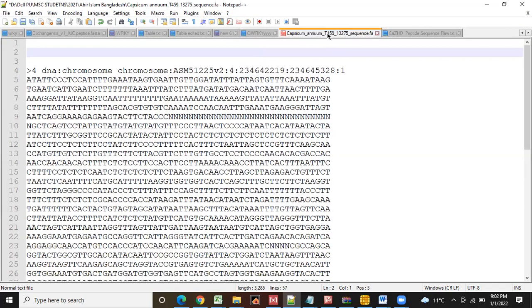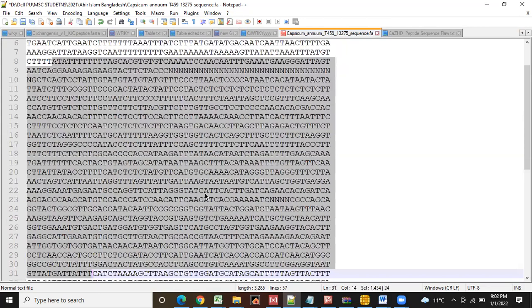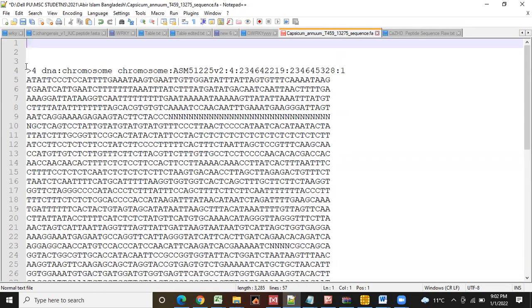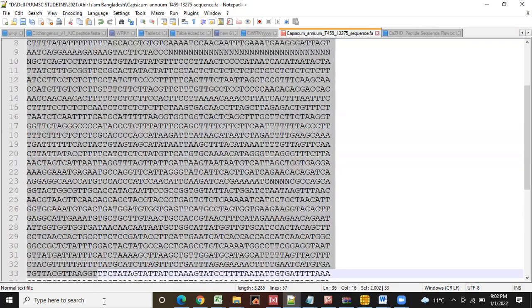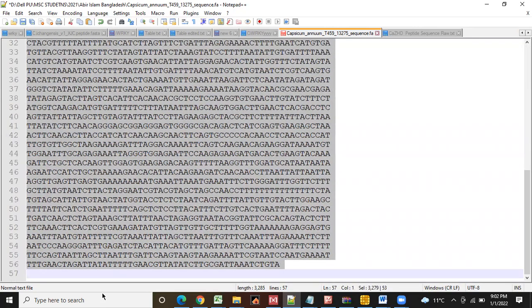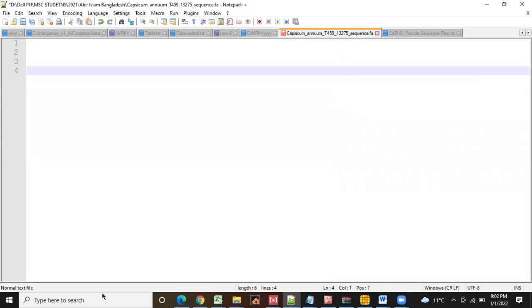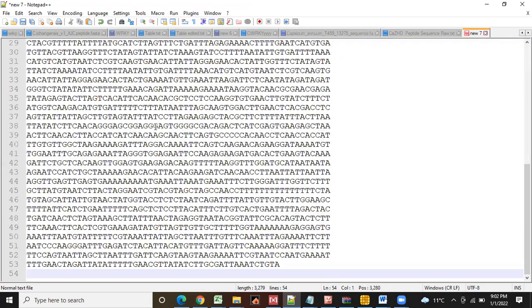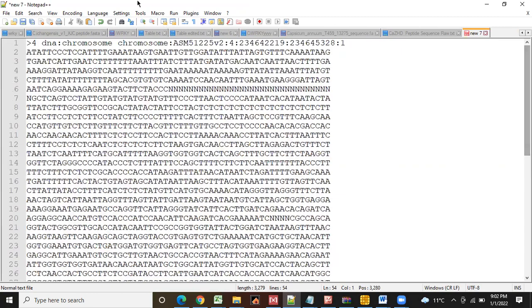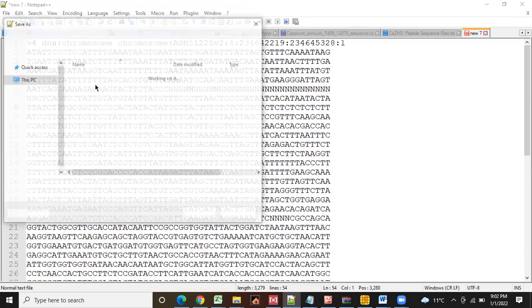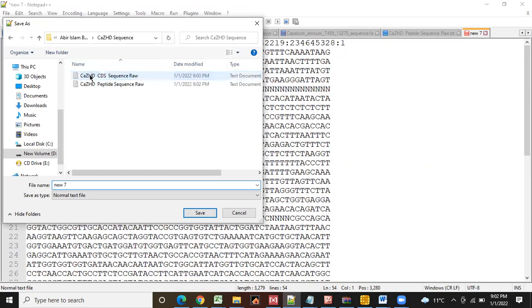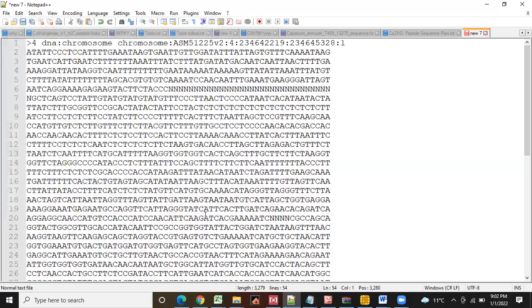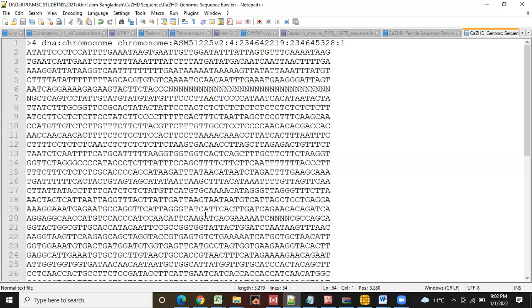Similarly, you will go with this overall. This is genomic sequence that contains promoter, open reading frame, and terminator. Control X, Control N, Control V. And you will write this as a genomic sequence. You got my point?